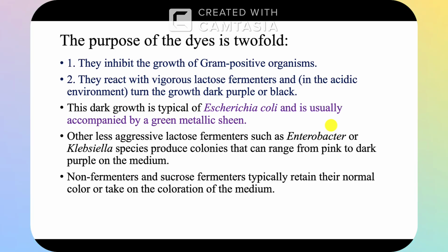What is the purpose of the dye in this media? The first one, these dyes, eosin and methylene blue, inhibit the growth of gram-positive organisms, so no growth of gram-positive on this media. And these dyes react with the lactose fermenters.